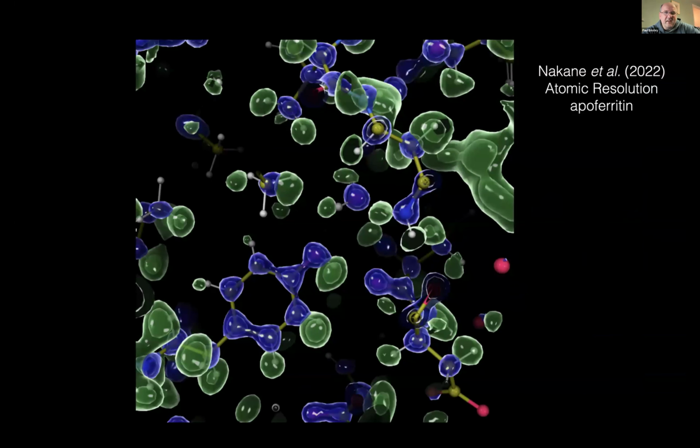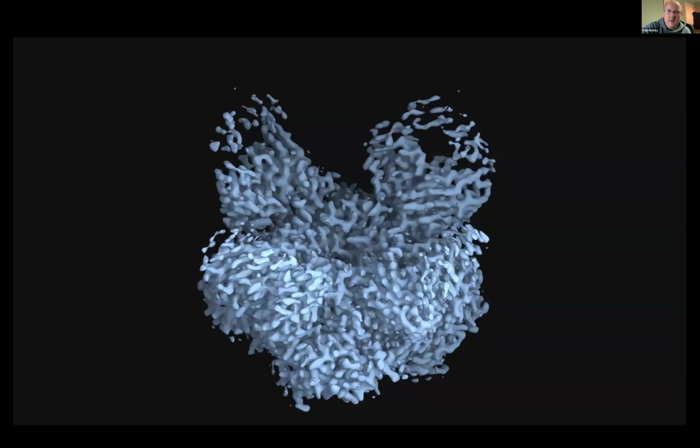So this is again COVID times from my colleagues who made this high resolution reconstruction in CryoEM. This is something published this week. Andrew Ward and team, where they had these antibodies but were not well modeled.